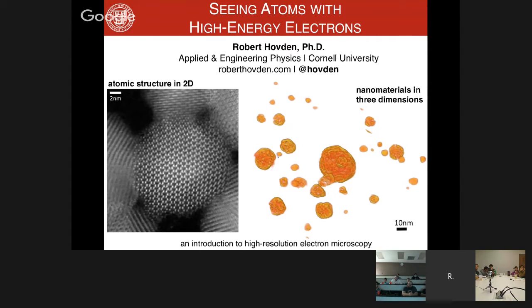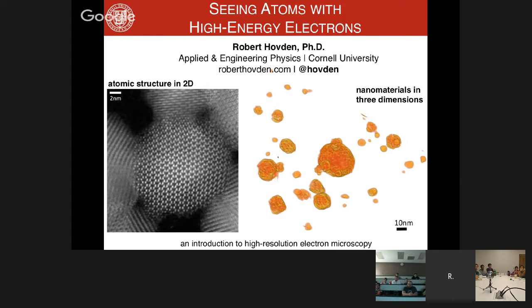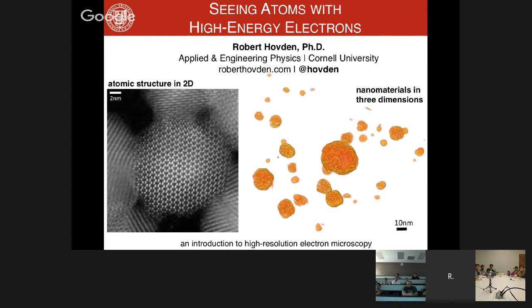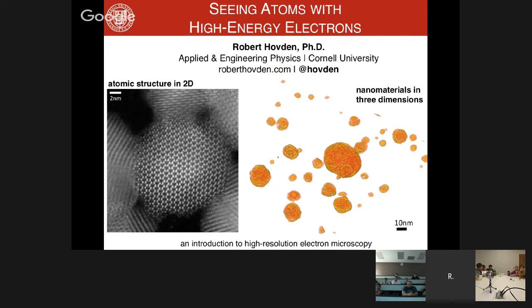The title of my talk is Seeing Atoms with High Energy Electrons. Of course, I don't intend to say that we can actually see matter with our eyes. It's clearly too small, the atomic structure at least. However, we can see these nanoscale worlds through the use of high energy electrons. The electron beams can be precisely controlled with the use of an electron microscope. And when I say precise, I mean we can actually position a tightly focused electron beam between two atoms. If we move that beam around, we can form images of atoms.